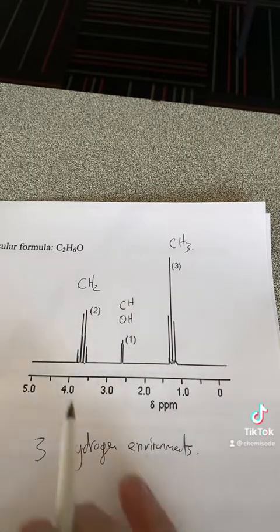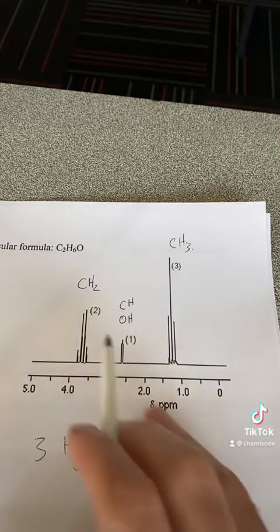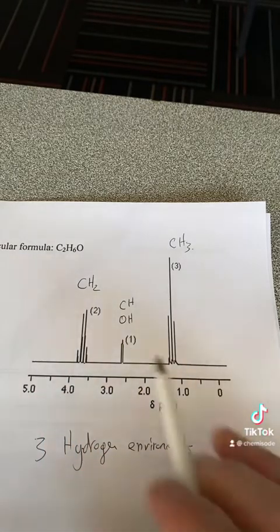So that's the first thing you get from your spectrum. You get, first of all, how many environments there are, which is 3, and how many hydrogens are in that environment by the size.